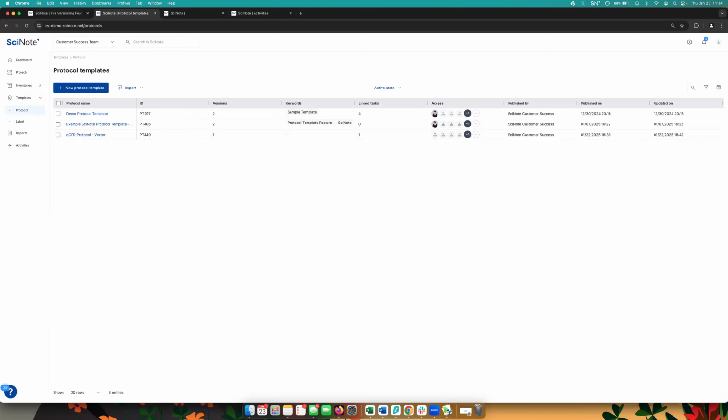Any other questions? Even if they're not related to file versioning, please feel free to ask them. Can you show me one more time how to modify a file externally from SciNote?